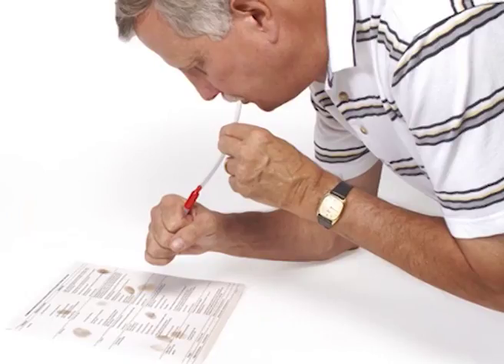Air is blown through the mouthpiece and the gun nozzle is moved above the surface impinged with the latent prints. The optimum distance between the gun and the surface is about 2 centimeters. As soon as the latent fingerprints begin to appear, the iodine fumes are concentrated over the imprinted area. The prints so developed are photographed immediately.